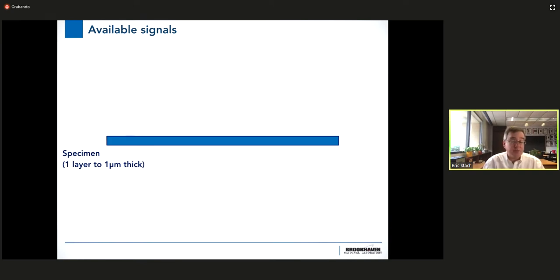So this, of course, implies something. It implies that in order to do transmission electron microscopy, you need to either have a sample that is already very thin, or you need to find a way to make it very thin. I'll talk at the very end of the presentation about one way of doing that, but there's a variety of different approaches, including simple things like literally grinding it down with a very fine sandpaper, using electrochemical methods for things that are metallic, using impinging ions in order to thin the material. But in the end, you need a sample that's thin enough that the electrons can transmit all the way through.